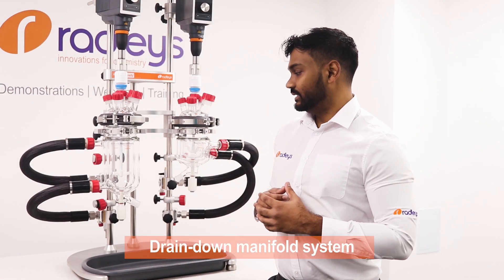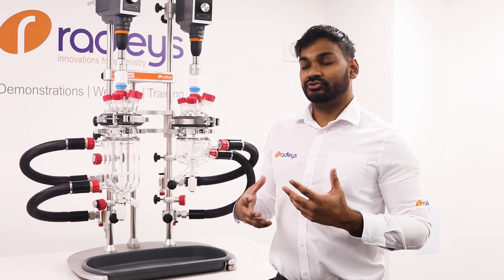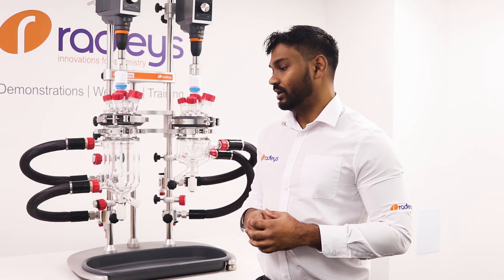Our drain down manifold system has an air vent on the upper manifold and a drain valve on the lower manifold. This allows you to drain the thermal fluid from the jackets of the vessels into an external container, which facilitates simple exchange of the vessels.